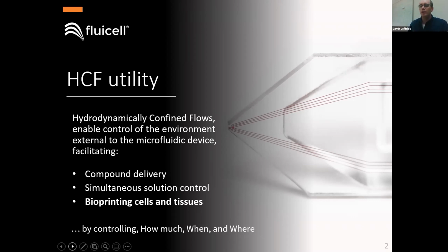But also, one thing I will show in a few slides is the ability to deliver things which are within the flow. So we can actually use it to bioprint cells and actually build the microenvironment that we want to probe with our single cell experiments.